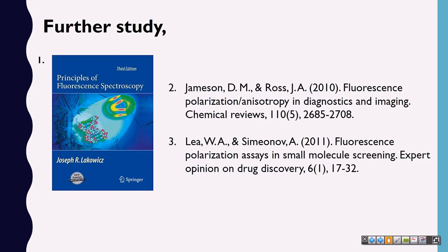So this is all about fluorescence polarization, and here is some reading material if you like. I like this book from Joseph R. Lakowicz from University of Maryland, Baltimore, and it is really very good for spectroscopy. They explain from A to Z, and there are a few reviews. If you have any question, I can go further to the liquid handling system. Okay, so let's go to the liquid handling system.